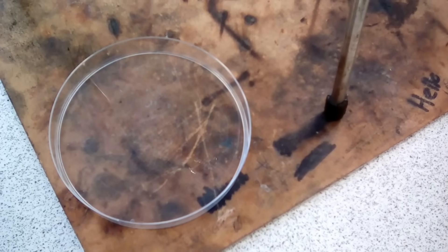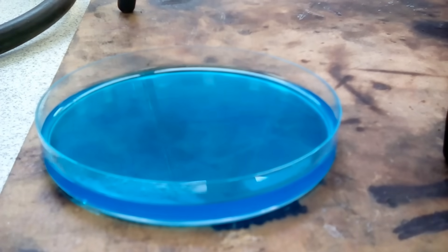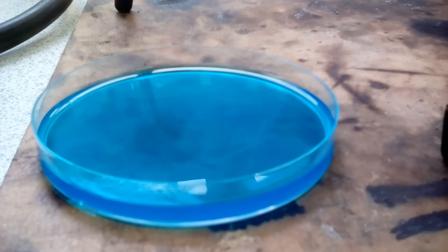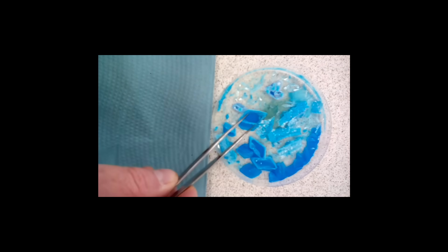Having evaporated off some of the water from our copper sulfate solution, we're now going to transfer it to a petri dish to allow it to cool and crystallise. If you look closely, you can see the steam coming off the copper sulfate solution. We shall leave this now to evaporate off.